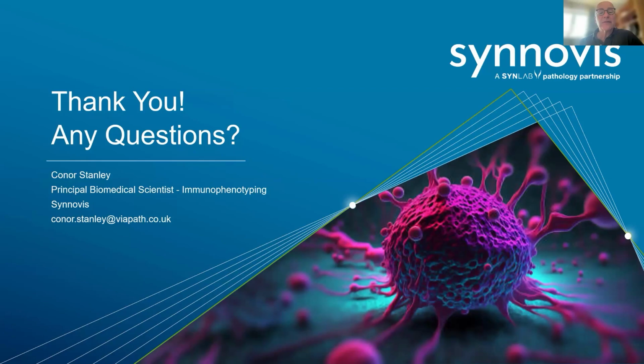I've got a quick question for our colleagues in Zambia. I know you send some samples away, but my experience of delays in delivery and poor handling of samples means that your chance of getting a wrong answer rises, I guess, exponentially with the amount of time that sample is in transit, and the nature of that transit. So the question for our Zambian colleagues is how often the samples they send away don't give a reasonable answer, or potentially give the wrong answer, even worse.